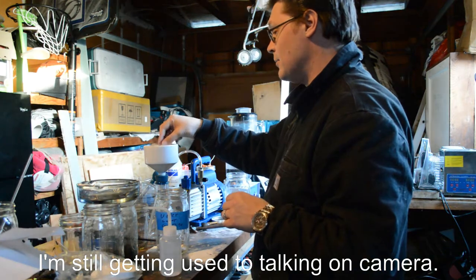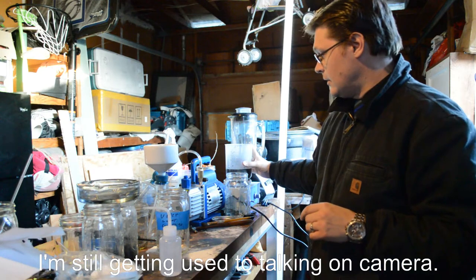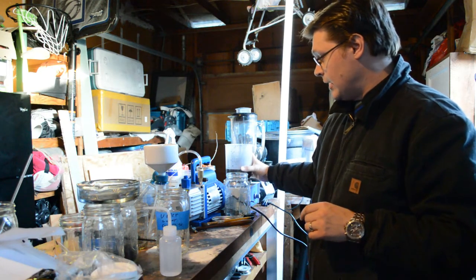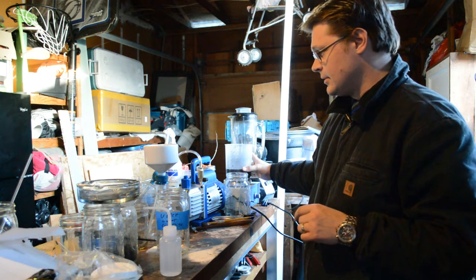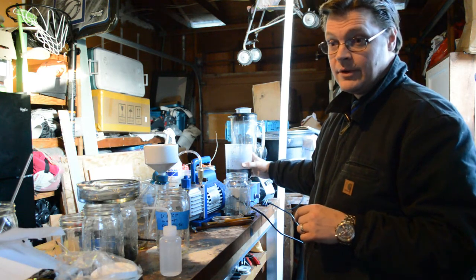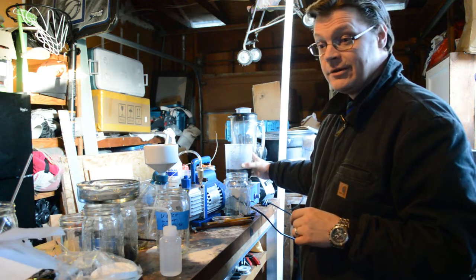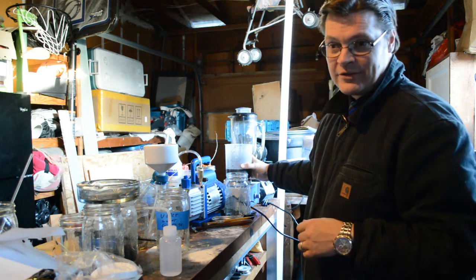And I ran it through the microwave. This has already been intercalated, washed, filtered, dried, ran through the microwave, ran through the blender, re-intercalated, washed, dried, and ran through the microwave a second time.